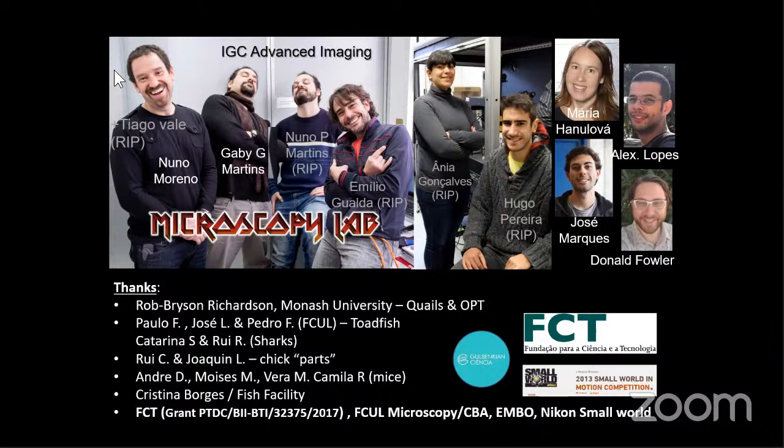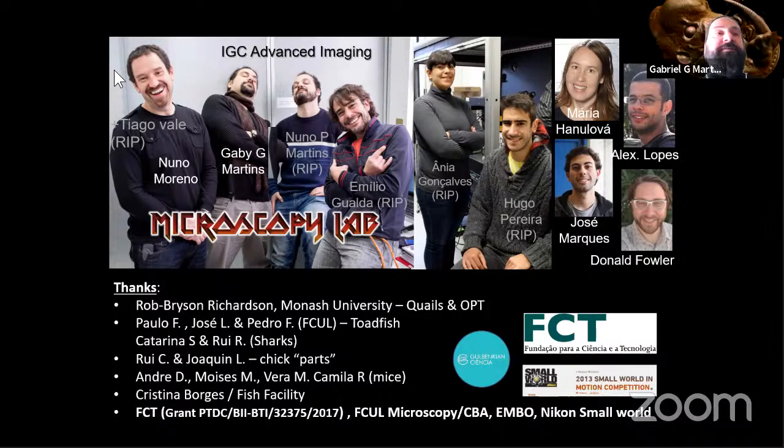I have one query. Can we image soft fields of hippocampus using 2-photon? Why not? 2-photon is actually used very, very often to image through brain tissue. Some people have demonstrated imaging as deep as 1-2 is pushing it a bit, but at least 1 millimeter through brain tissue. I have to confess, with our system, we were never able to image more than just a few hundred microns on fresh tissue.